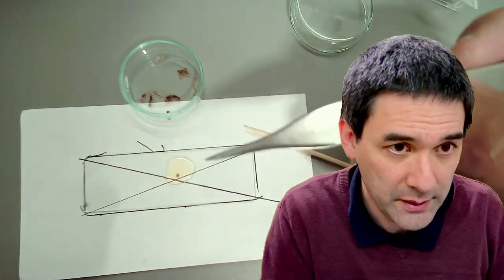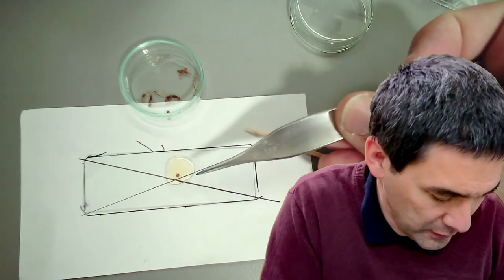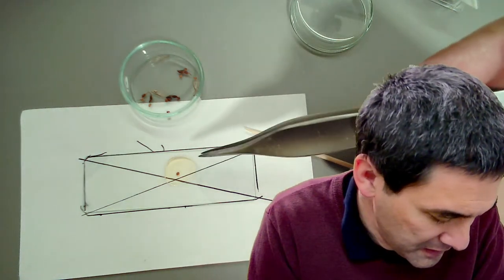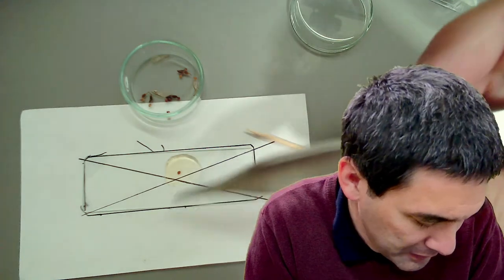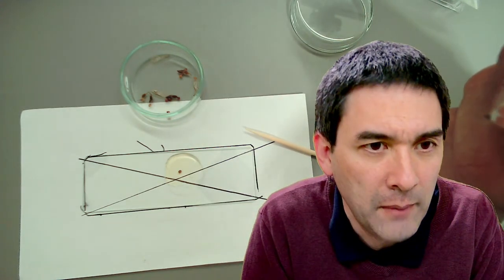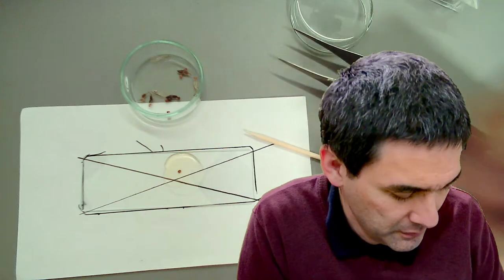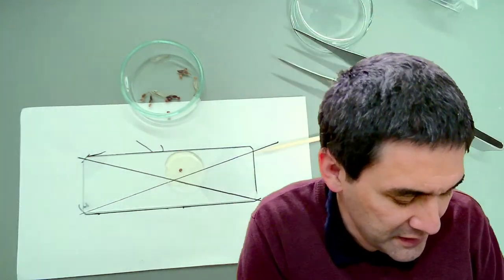And then let's try this. It's difficult for you to see, okay? But here, and then I drop it on here. And I hope that the specimen stays more or less in the center. Okay, and I let capillary action do the rest. Now how long does it take to dry? A couple of weeks. Yeah, look, it's moving a little bit, but that's okay. As long as it's more or less in the center.